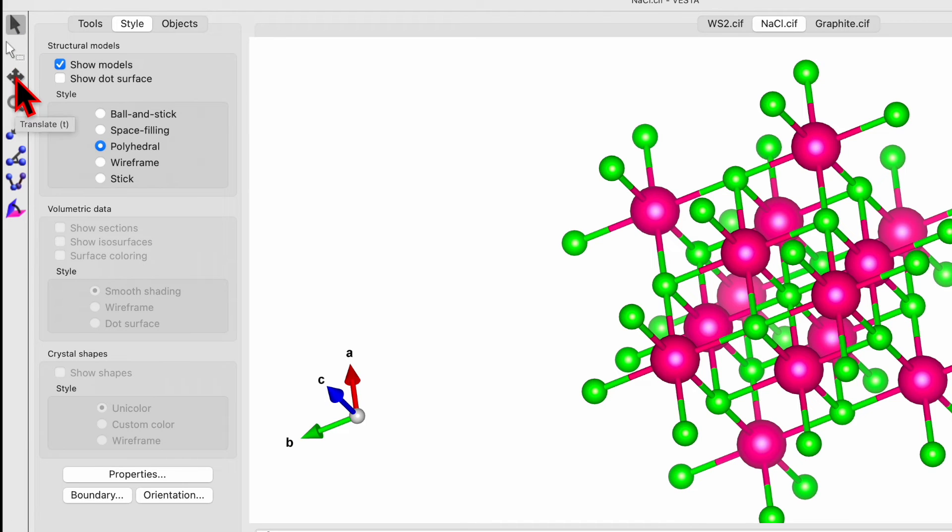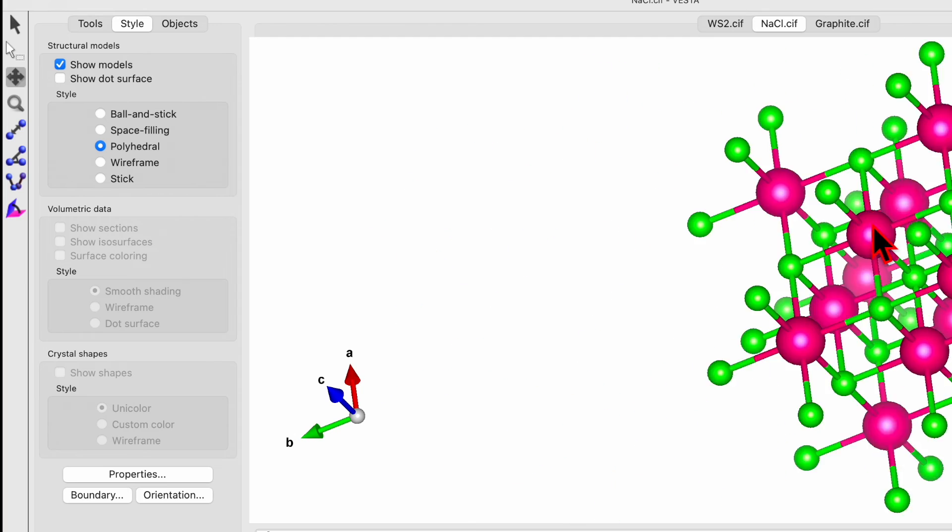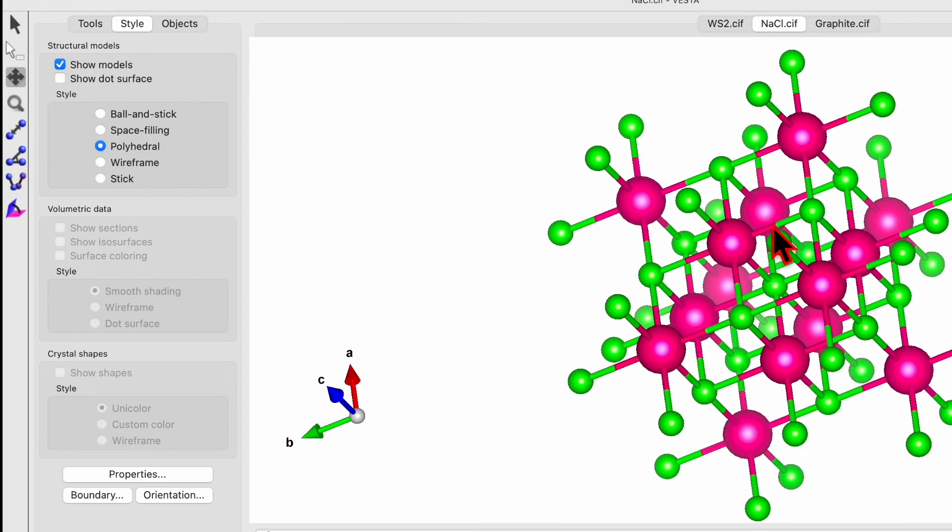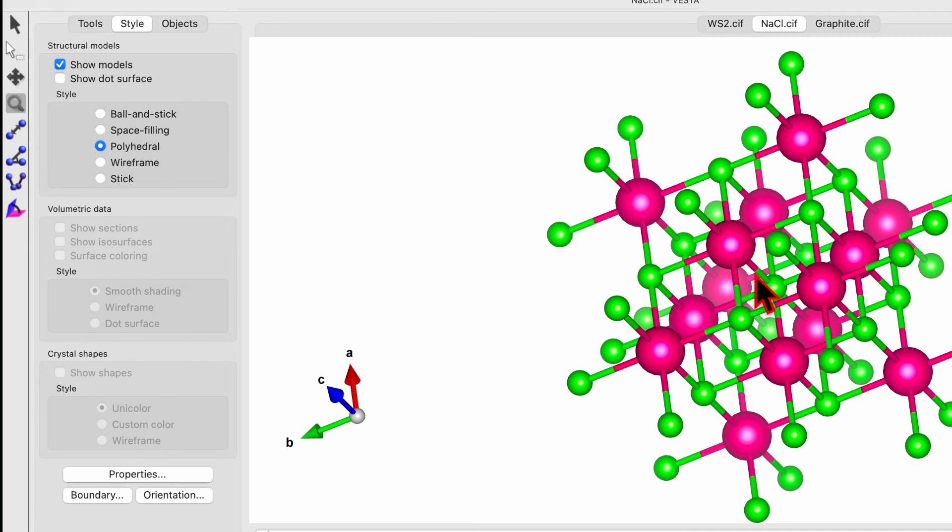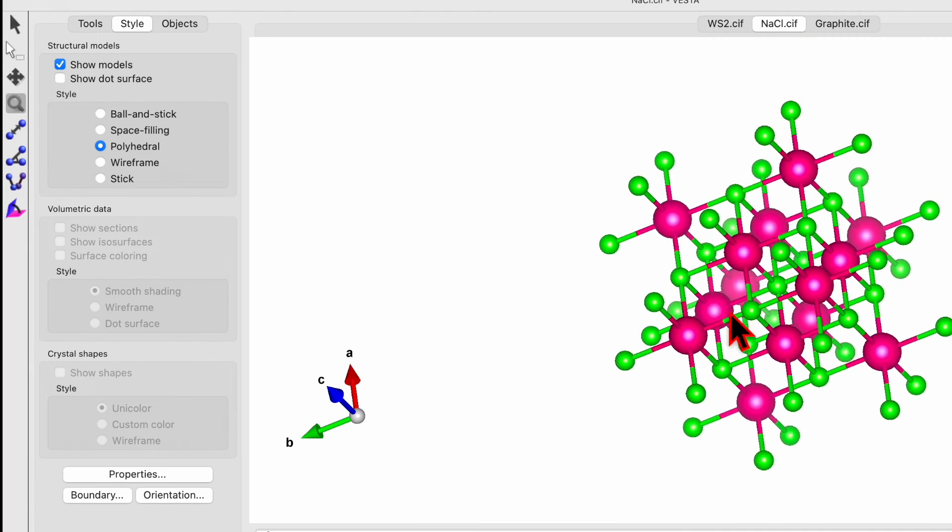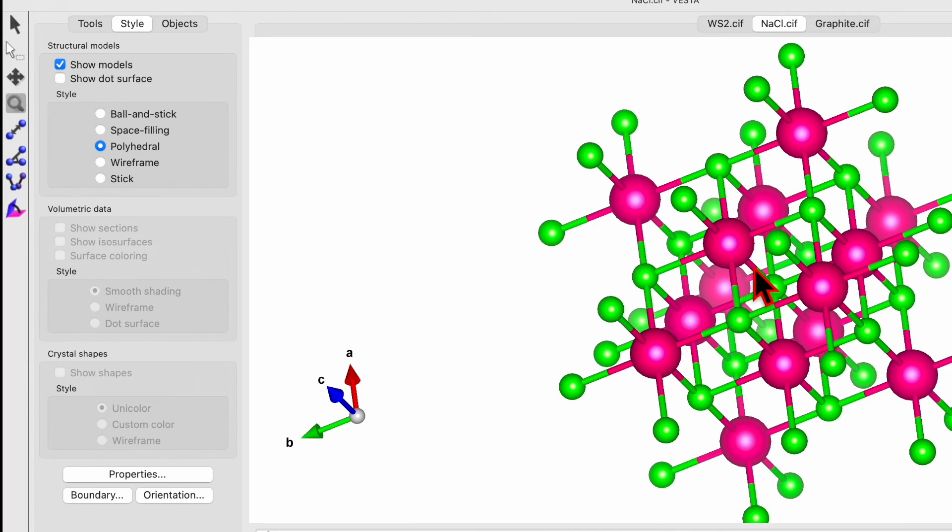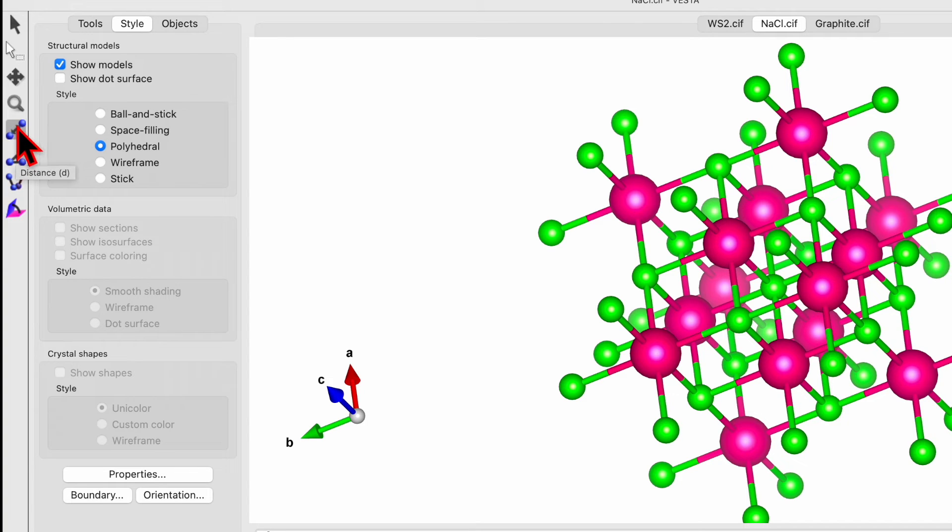Then here we see a translate option. So if you choose this one, you can simply move your unit cell wherever you want. Then we have a magnifying option. You can magnify using this option. And then we got option for the bond. It can help you measure the distance between the two atoms.